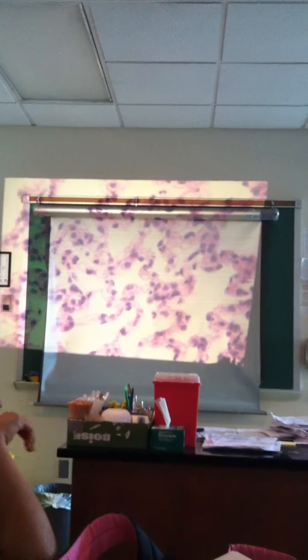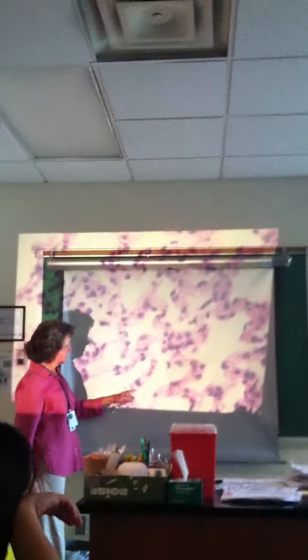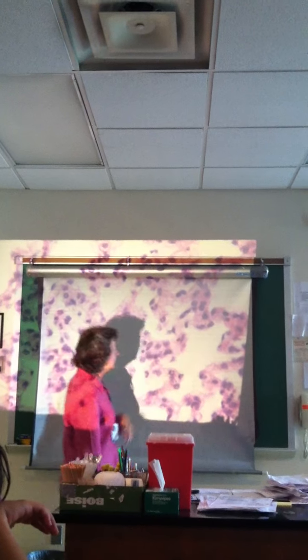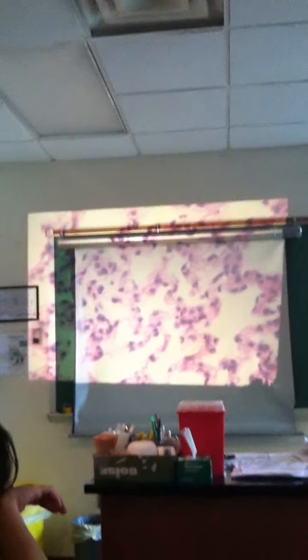So these are your alveolar air sacs of your lungs, and you've got to have oxygen and CO2 go across. So they are made of simple squamous. The reason we didn't assign it is when you lay it on a slide, they flop over like you're looking down at a polar view of them, so they start looking like a fried egg with a yolk inside. Every now and then, one will stay on its side like you wish they all would, and it looks very squamous and realistic. But this can be more confusing to a student when you don't realize everything tends to just flop over when you take something like air sacs out of the lung. So you won't be tested on this, but it is another simple squamous tissue because it's for transport.